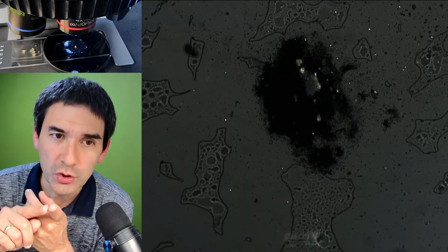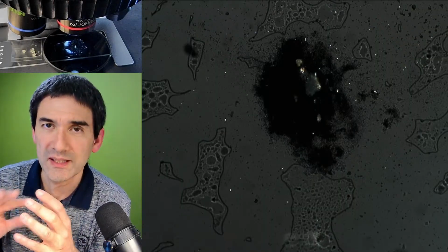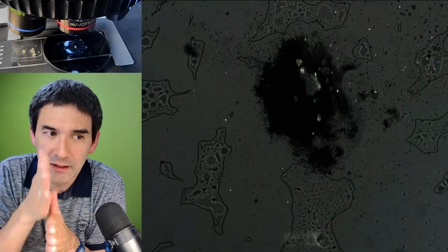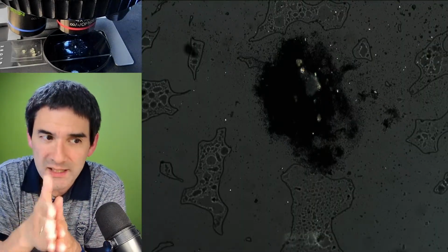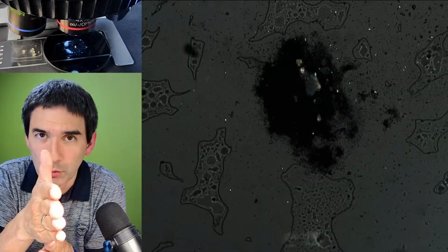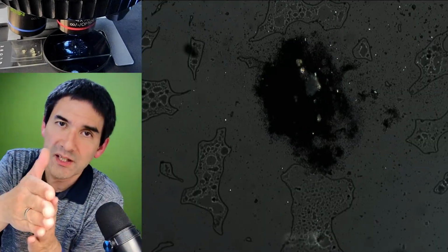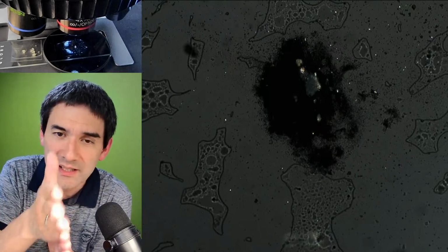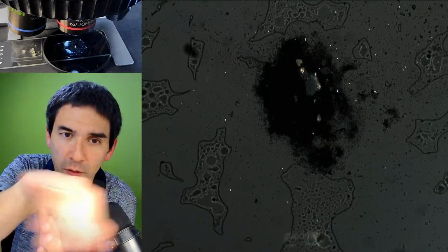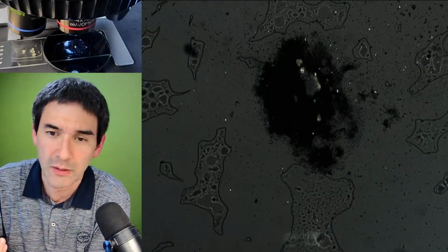However, some structures, like we've seen over here, are not polarizing themselves but simply depolarize the light. The light rays enter the specimen in one plane, and if the specimen is polarizing, it will turn the plane. But some specimens let the light enter in one plane and it comes out in all different directions, and then you're able to see it as bright on a dark background.